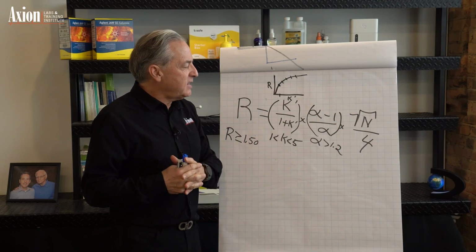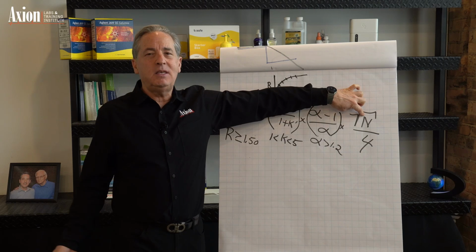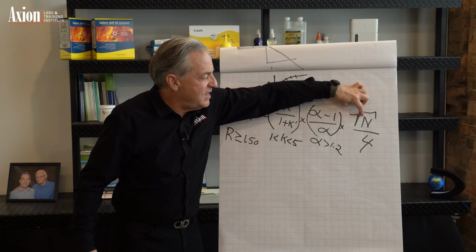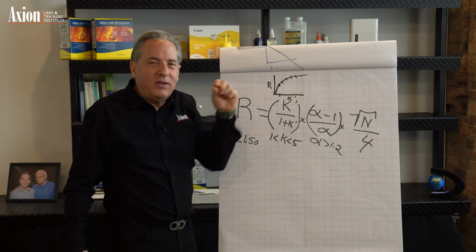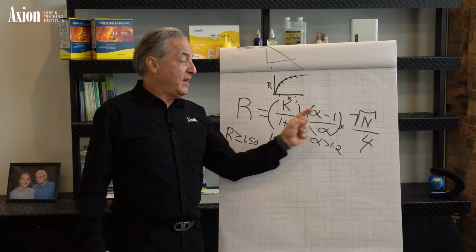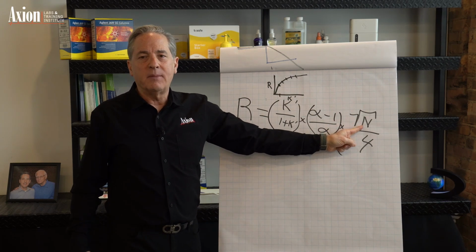In GC, it says, hey, we have so much efficiency. In GC, you could buy a 400,000 plate column off the shelf. I've got so much of this, I don't need very much chemistry. I only need 5% of your chemistry, 1.05. I need a little bit of chemistry because I've got a great big giant sledgehammer here.